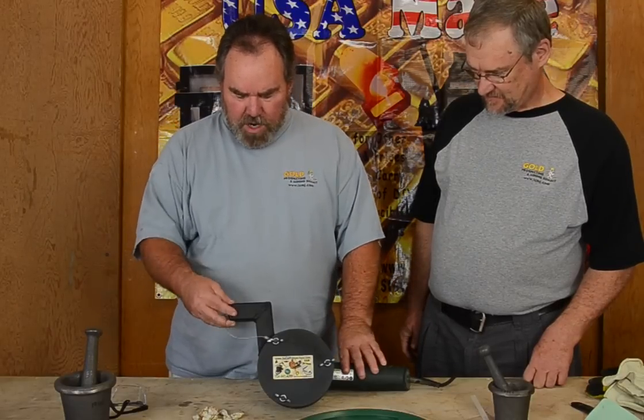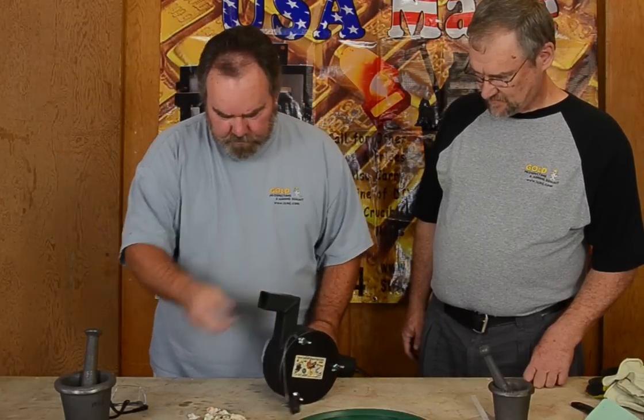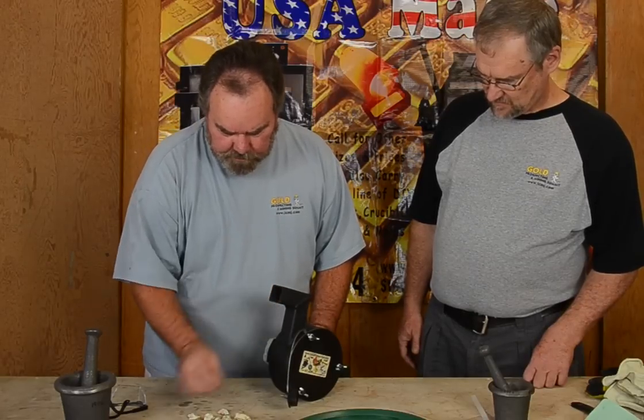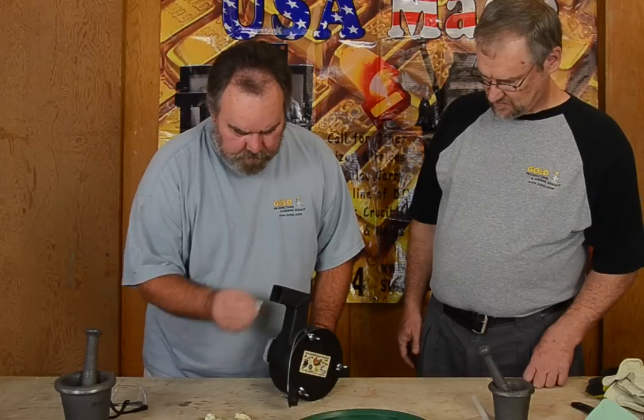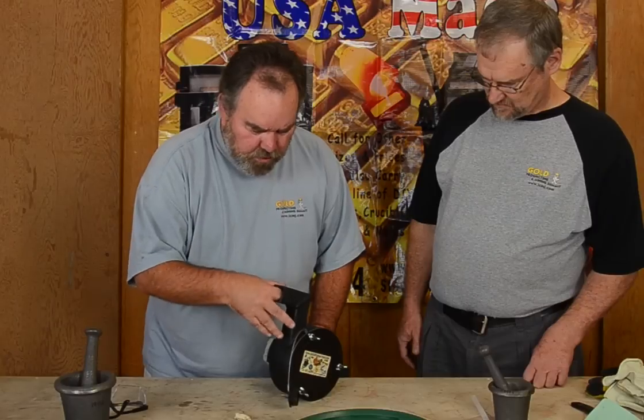Now you just take the cover off and load in your specimens — anything that will fit inside. You load it up; it does not have to be running. This is great.